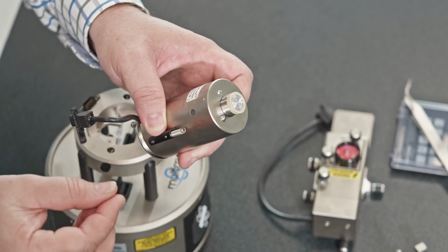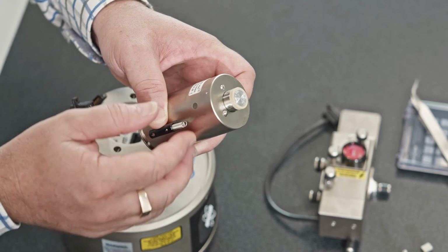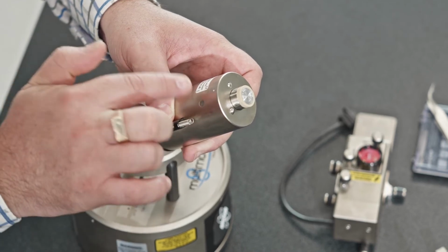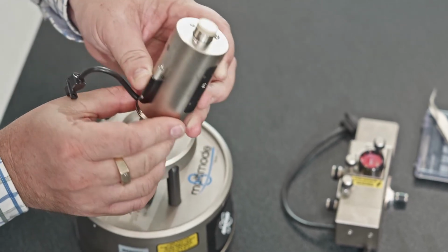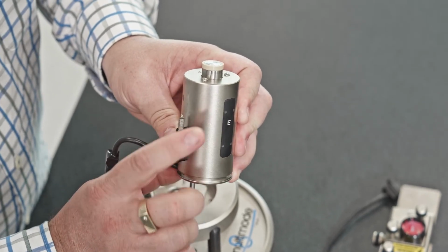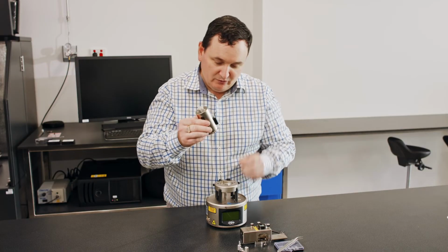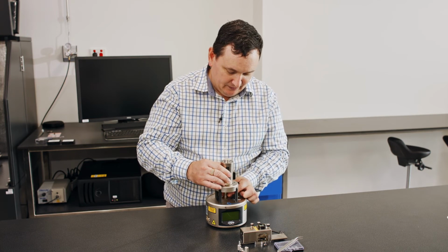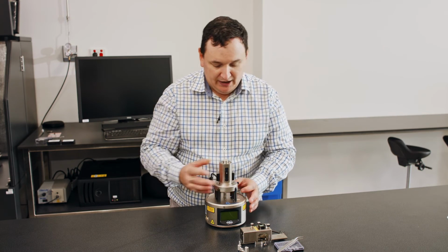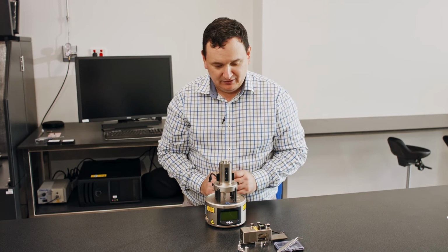It's very thin walled, and it allows us to move in a very precise motion down at the nano and angstrom scale and over a range of around 10 to 15 microns for this particular scanner. So this particular scanner is called the E-scanner, which is a high resolution, nominally 10 micron, but this one will do around 12 microns. And you can see it's designated an E on the front. So this one here, it slots into here, like that. And then we'll have a locking screw which comes up underneath. But remember, you're not getting down to the level of disassembling this.